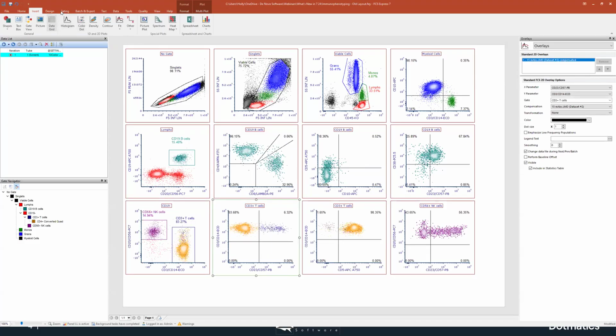If we come up to the gating tab and add another quadrant on here, they just move. We're not prompted to create a new set of quads or anything like that. So as is, this functions very, very similarly to the way it functioned in the old version. It's important to note that the gates are there. Quadrants are gates, whether you choose the new default or the old style method. The difference is that for this particular set of options, they are here, but they are hidden and we've turned them off.